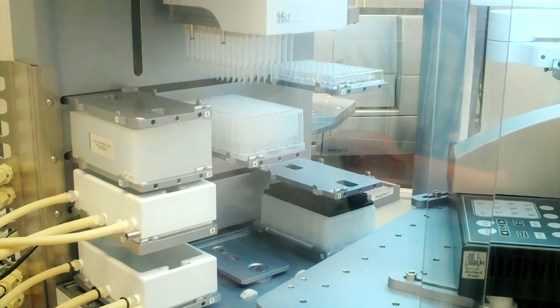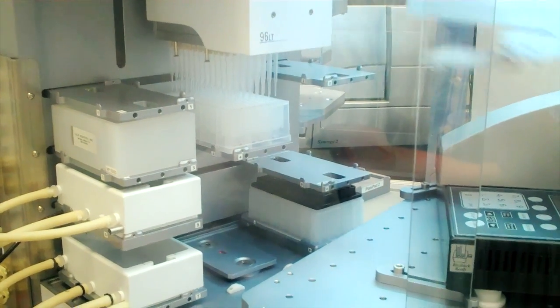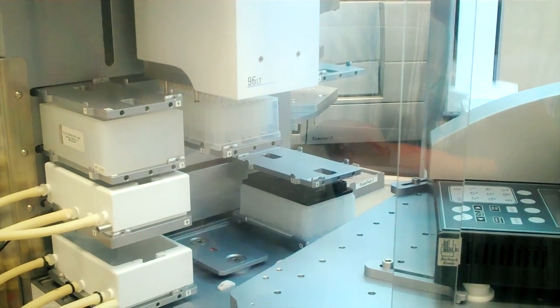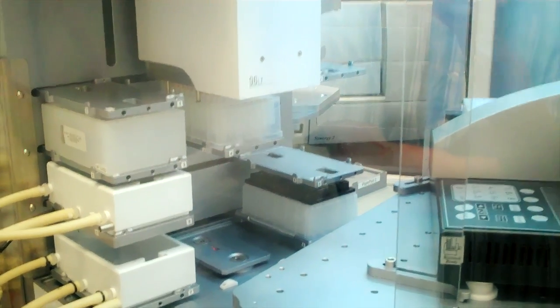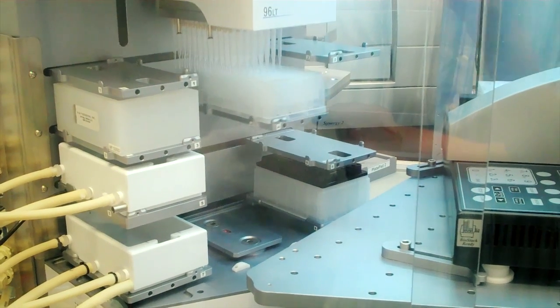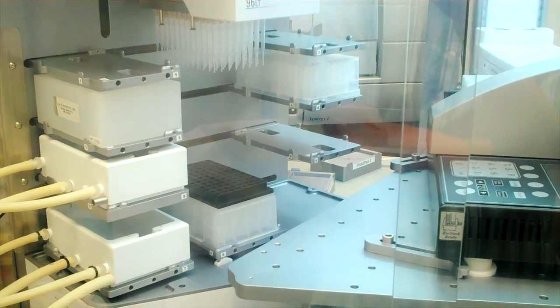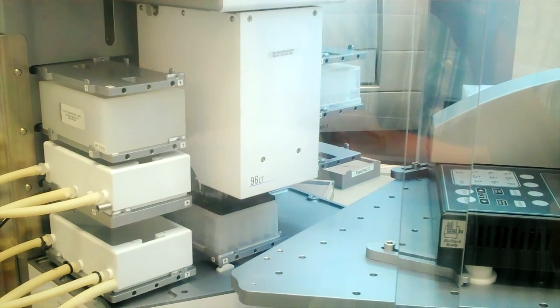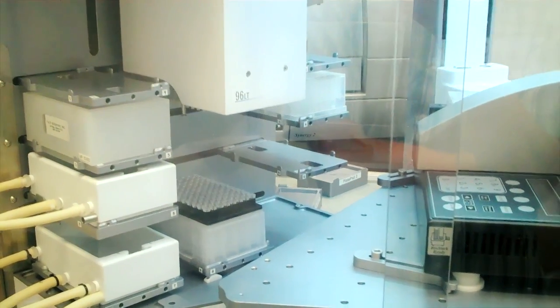So we take advantage of the robot's ability to manipulate and move these liquids around at high speed in a high throughput format. That enables us to do tens of thousands of experiments that would be beyond the reach of an individual grad student. And so the grad student now can focus on the data that the robot generates rather than moving thousands of liquids around for several weeks.